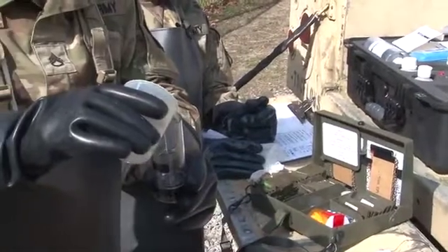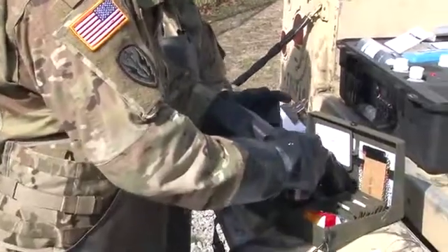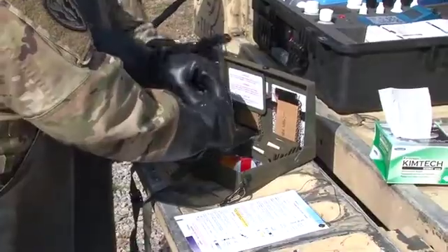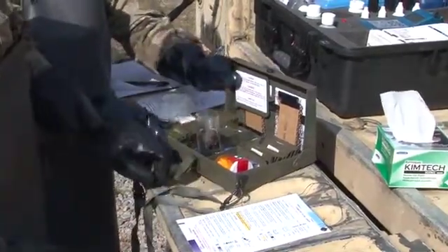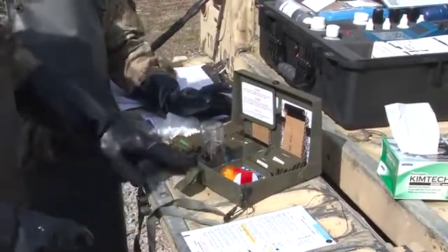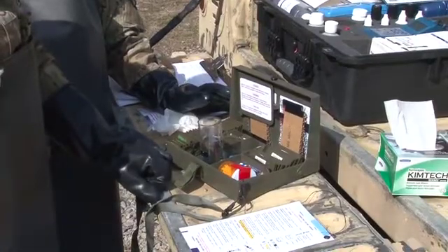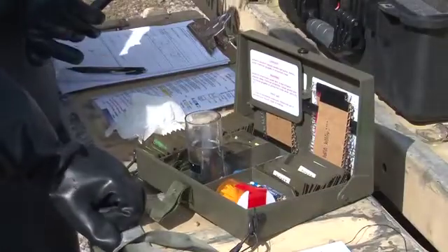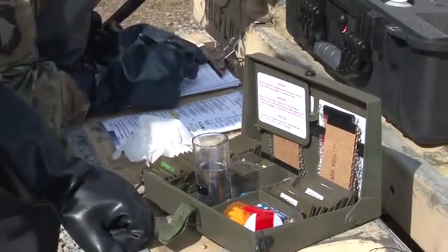Fill the bottle to the fill mark with the water to be tested. Press the bottle into the case bottom holder. Check the water temperature of your sample. If you have an older kit, you will use the thermometer. If you have a newer kit, you will use the test strips found here. Make sure you allow 1 minute for the test strip to work. Document your temperature reading.